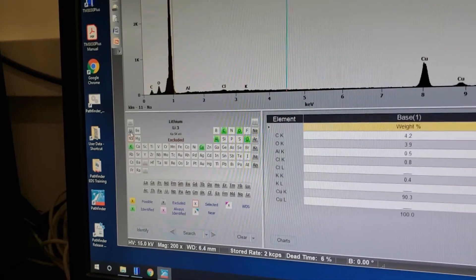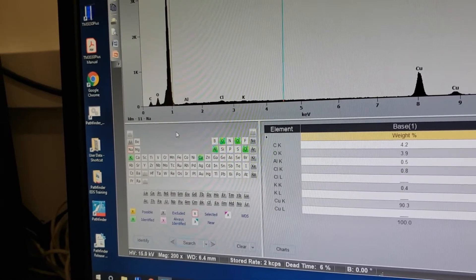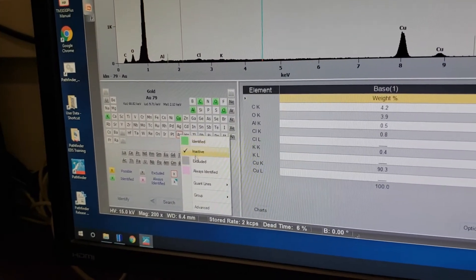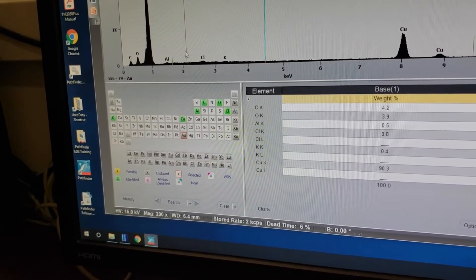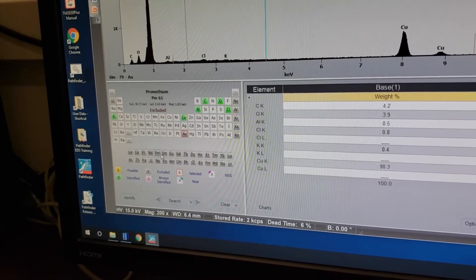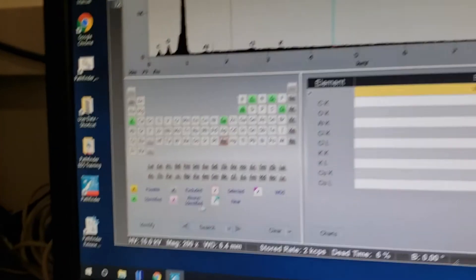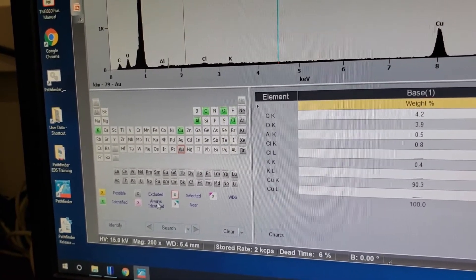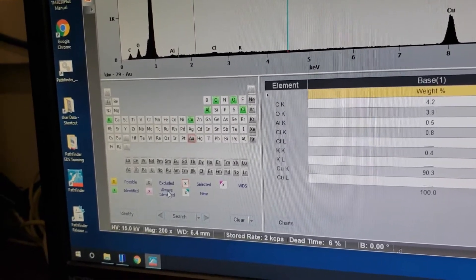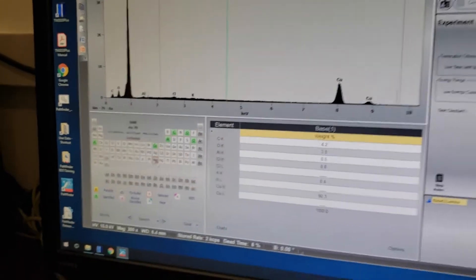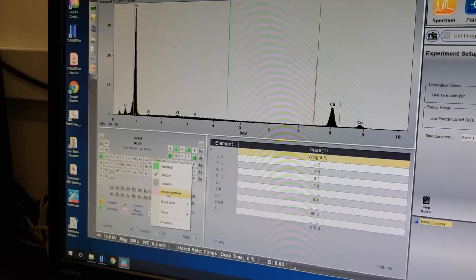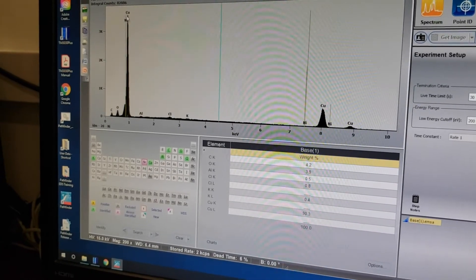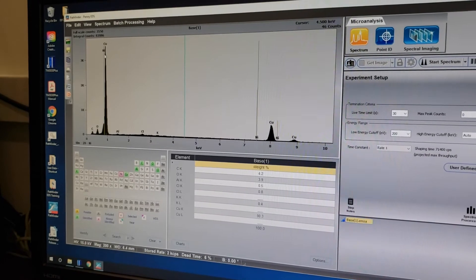You can't see noble gases with an EDS detector, and it's also not looking for lithium. If I had gold sputtered on my sample and wanted to ignore it, I can right-click on gold and click Excluded, which removes any traces of gold from the graph. The pink option — 'Always Identified' — forces the software to see a particular element. For example, if I know there is nickel in the sample, I can label it as always identified, and it adds nickel to the graph.